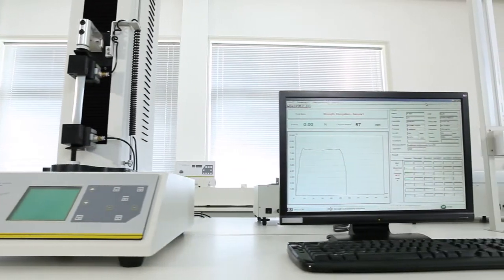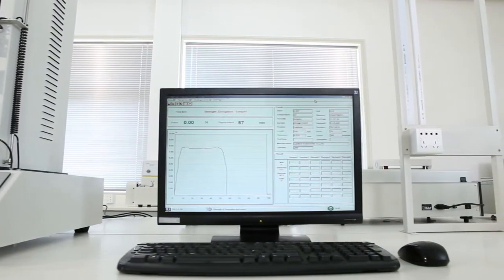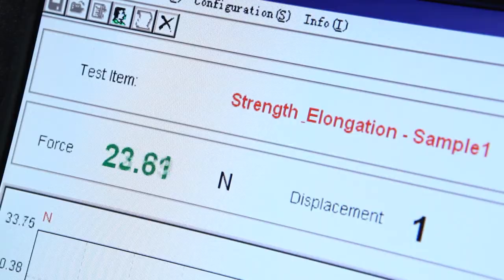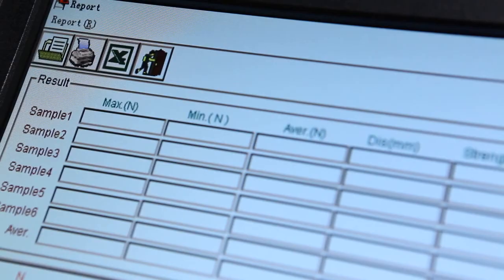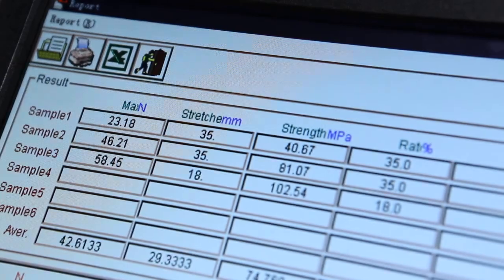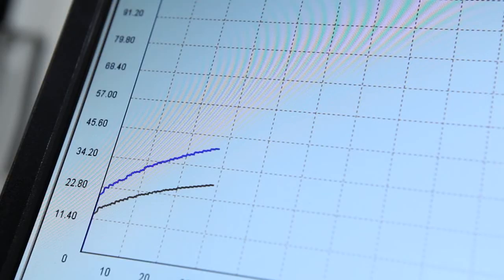The testing software has an intuitive operation interface and visual display of real-time data and graphs. It can carry out historical data comparison and curve superposition analysis.